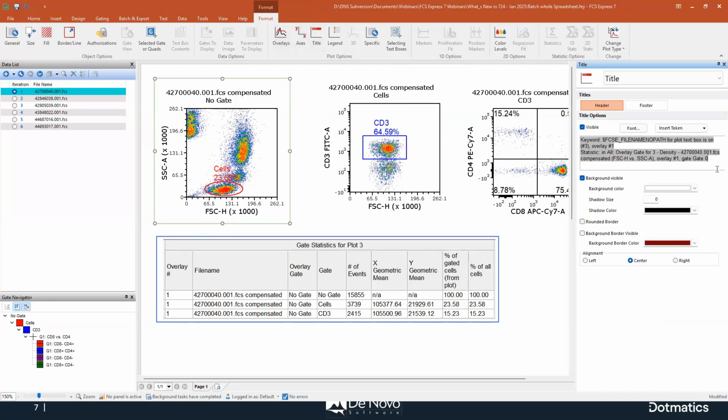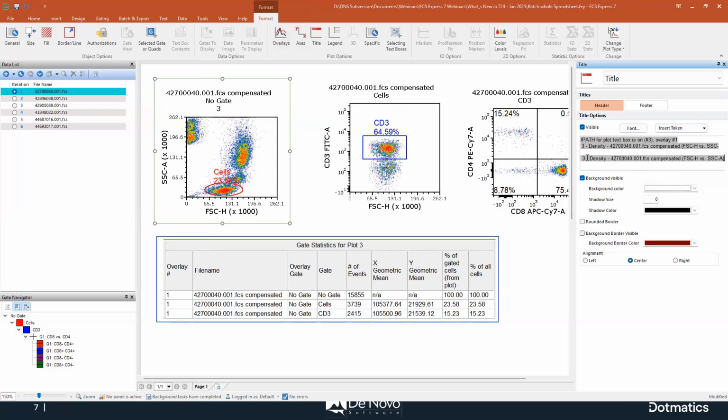I see some users do it by default. So you see here, I can start a new row in the title of this plot. I can select here plot number. Okay, so this is plot number 3. You can also append some text, for example, plot ID, whatever. Okay, sorry, I mistyped it. So you can also set it as default. So in any plot, you will see the plot ID, or you can keep it really like this. Anyway, you see plot number 3, this is plot number 3.